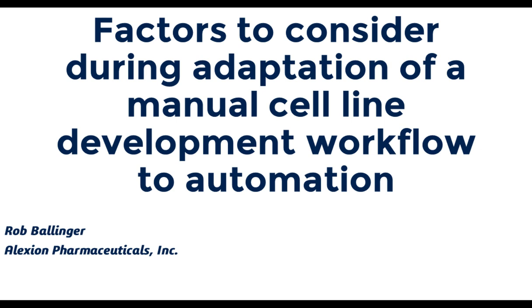Hello, my name is Rob Ballinger, and I'm a Development Associate 4 at Alexion Pharmaceuticals in the Upstream Development Group. This group includes cell line development. We recently converted our manual cell line development process to an automated workflow. I'll present some factors to consider during adaptation of a manual cell line development workflow to automation based on what we've learned in that experience.